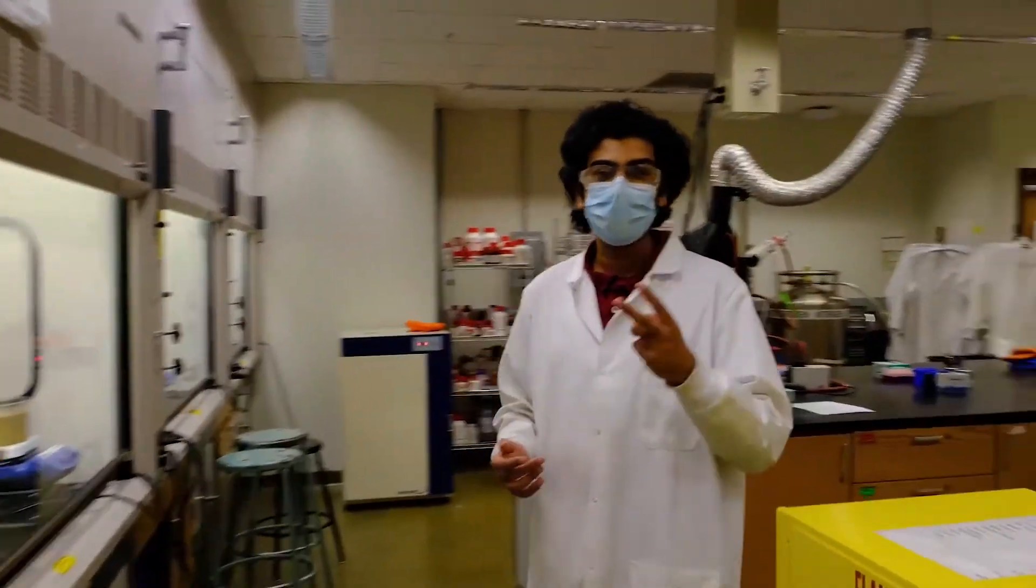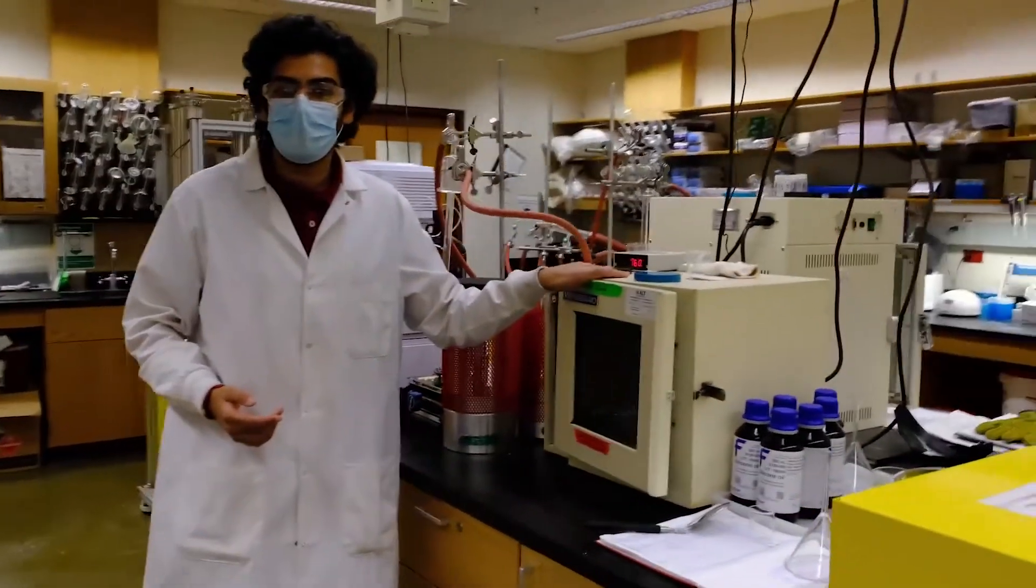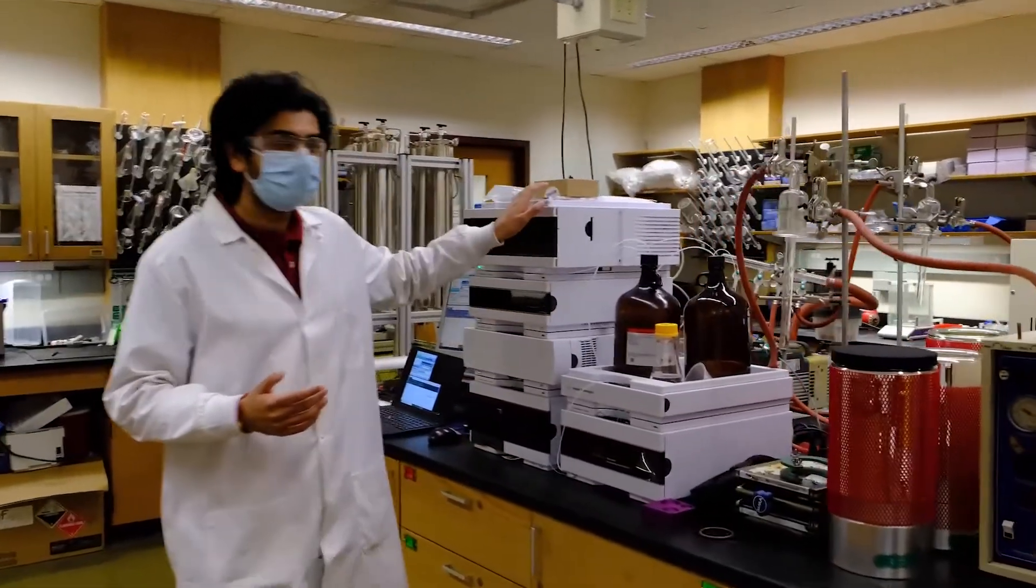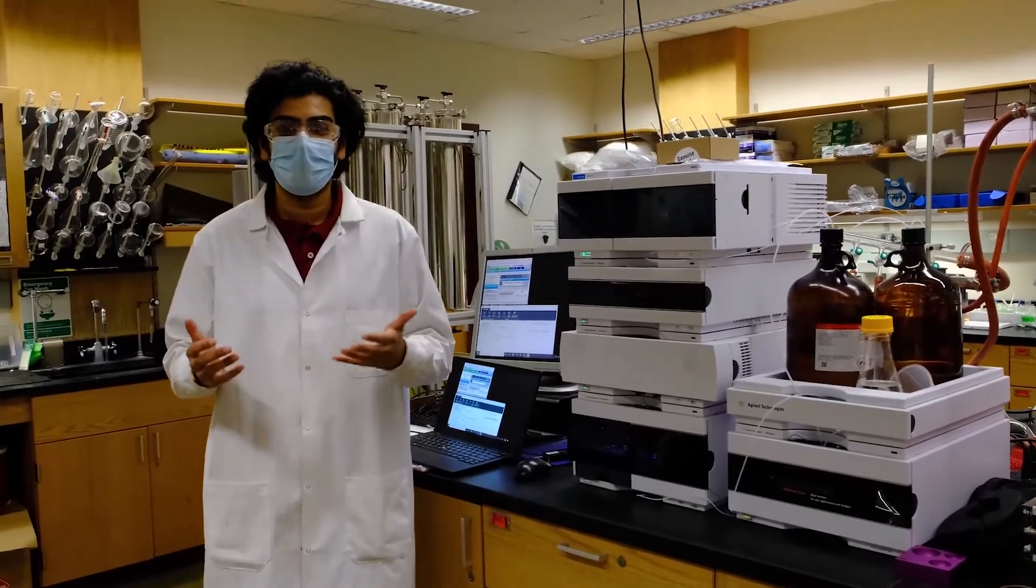Additionally we have two vacuum ovens where we are able to completely dry our polymer samples. After completely drying our polymer samples we then utilize a size exclusion chromatography system for determining the molecular weights of these polymers.